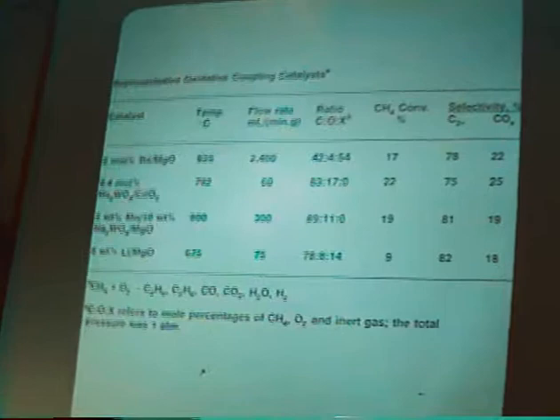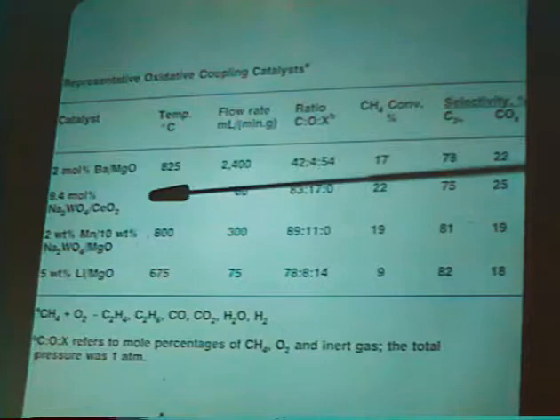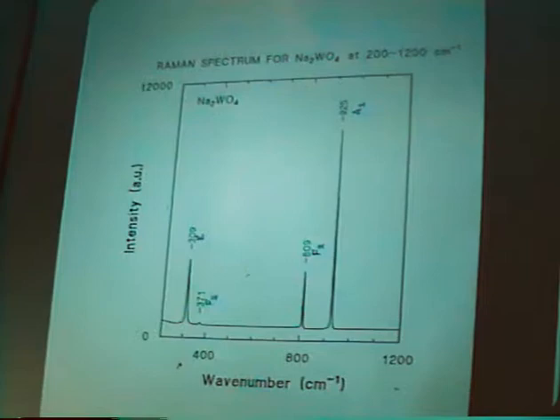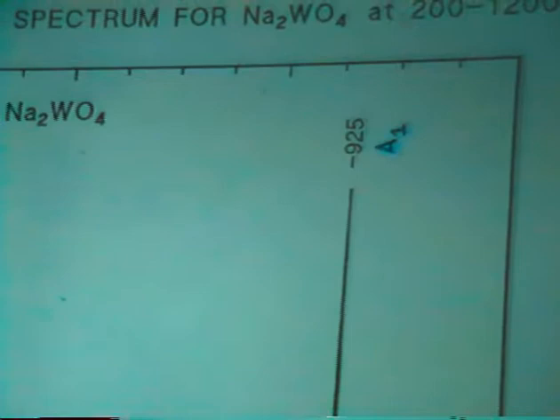Now I'd like to turn to the second catalyst, and this same issue will arise again, but that is the sodium tungstate on the cerium oxide. First of all, let's just look at pure sodium tungstate, which has a Raman spectrum at room temperature. It's very sharp. This has been reported, among other places, in the spectrum by Israel Wachs, and probably predates his work even.